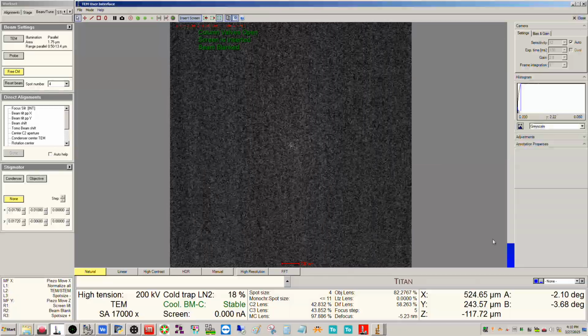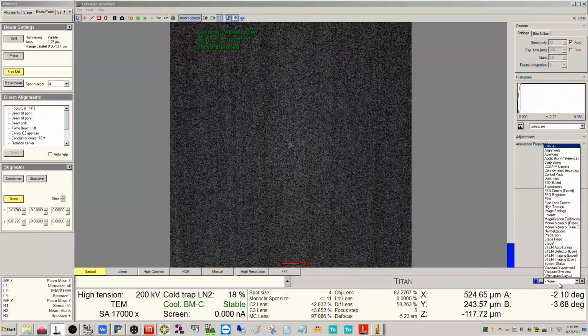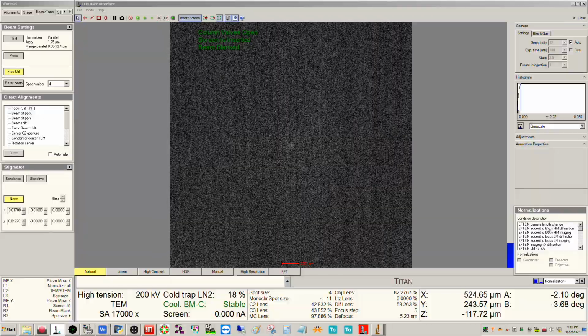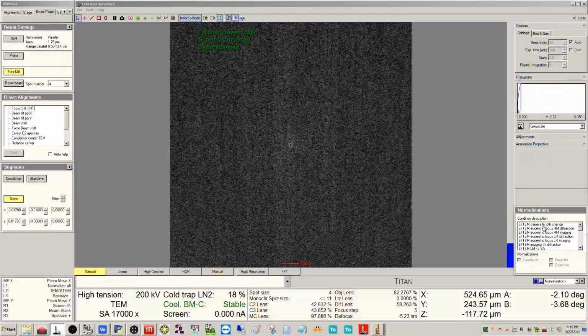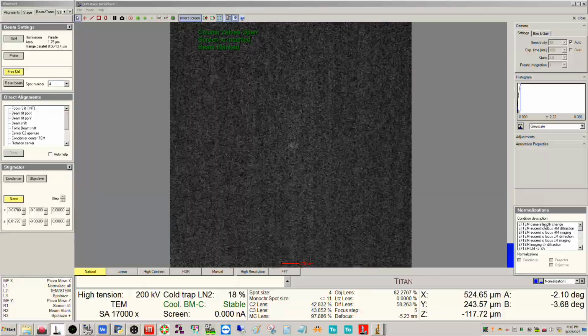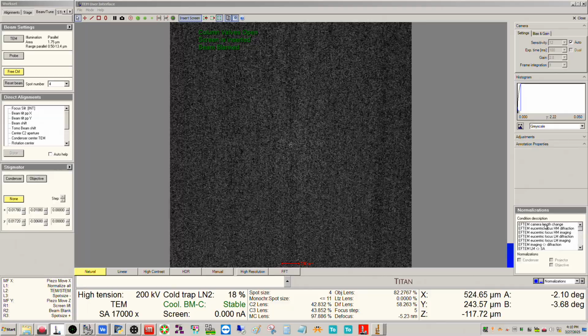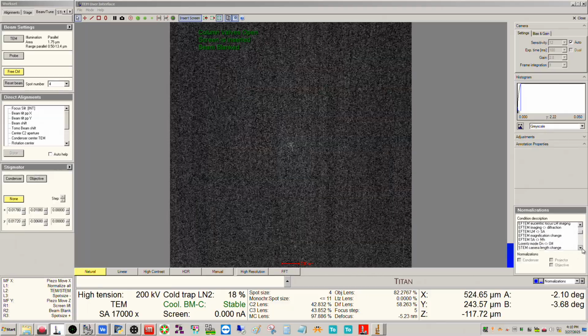So what normalizations are happening? If you go, you can find your normalizations control panel here, and you can see all of the different condition changes, because this is where you have normalizations. They happen when you're changing some kind of setting on the microscope. Okay, so we can see here, let's go to a really common one.